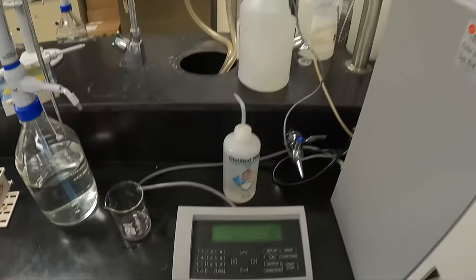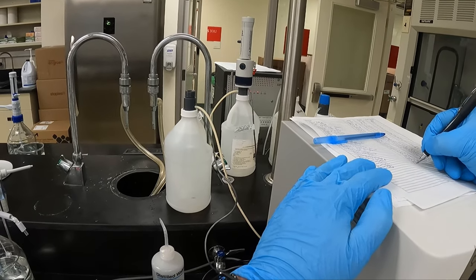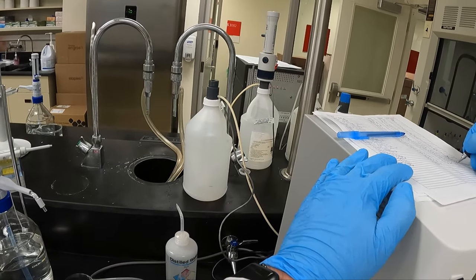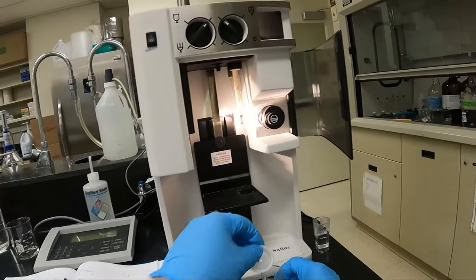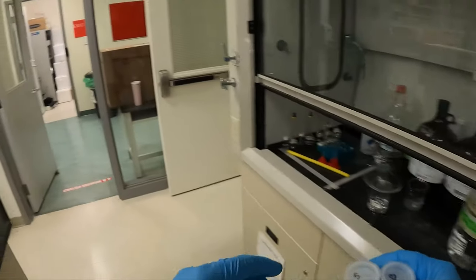We got a count of 34, well below the 50. Now in my lab, there's a log on top of each of the Coulter counters. You put your name, the date, the time, and the final count. This way we ensure that everyone has cleaned the probe when they are done. We'll put the cup back in with some isotone. Remember, the probe must be kept wet at all times.